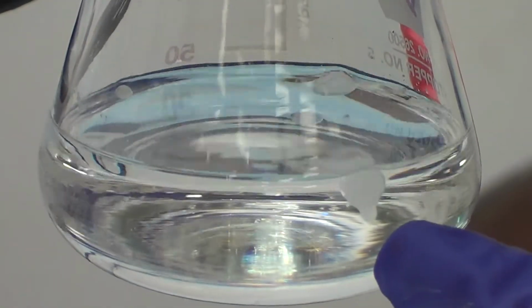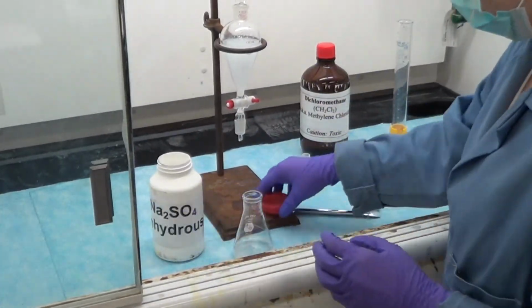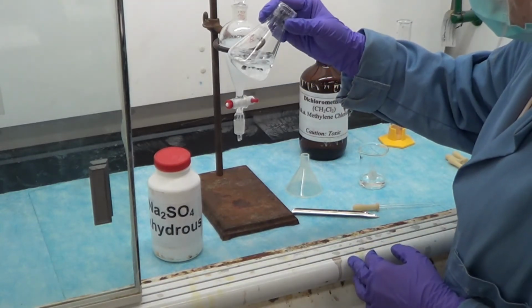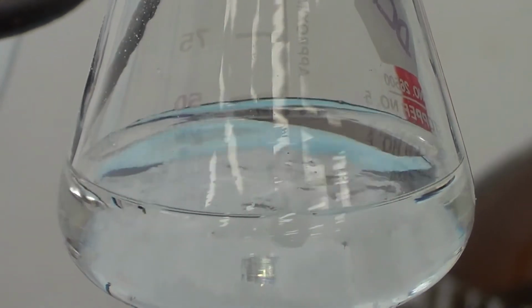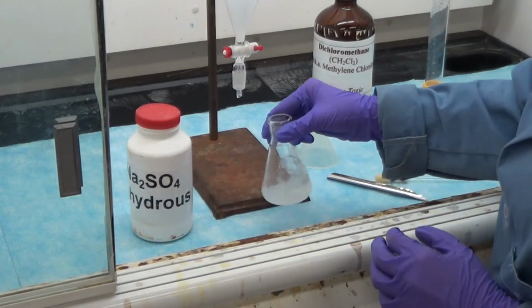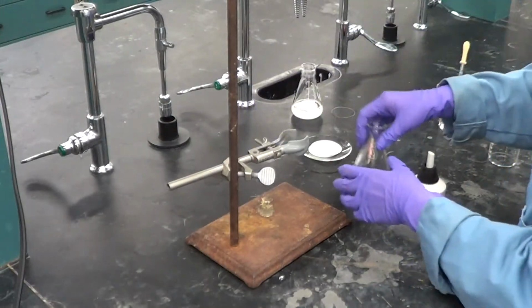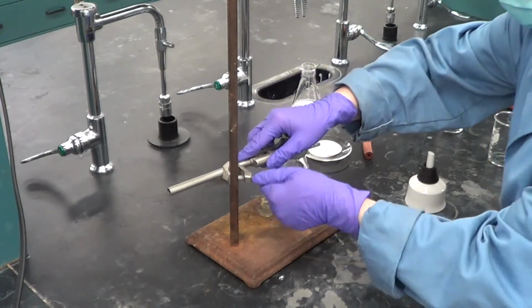The organic layers are combined into a single flask. That cloudy bubble that you see at the top is water. To remove it, simply add sodium sulfate and swirl the solution. If there are still water bubbles present, add more sodium sulfate. Once the solution is water-free or dry, decant the solution via vacuum filtration.